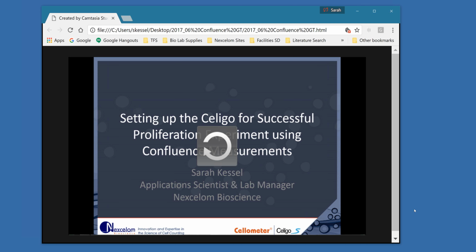So we've done parallel studies where we basically analyze the same images in confluence and direct cell counting, and it paralleled very well. I feel the challenge you have with direct cell counting is when your cells are so flat that the bright field algorithm will struggle with very flat cells. Like MCF7s, they tend to form colonies and are very flat cells. So I would prefer to use confluence over direct cell counting. So again, it's cell type specific.